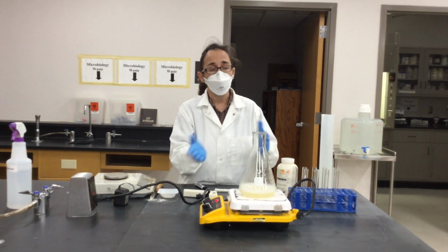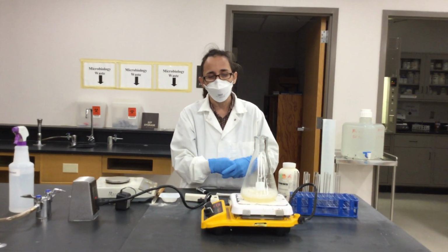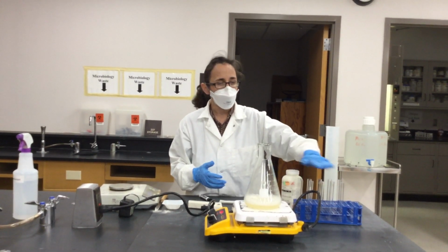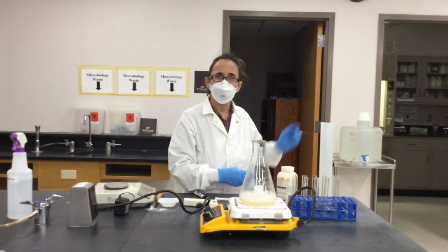And then once this happens, I will restart the video, and then I will show you how to dispense this media into the test tubes and how to put it to autoclave.